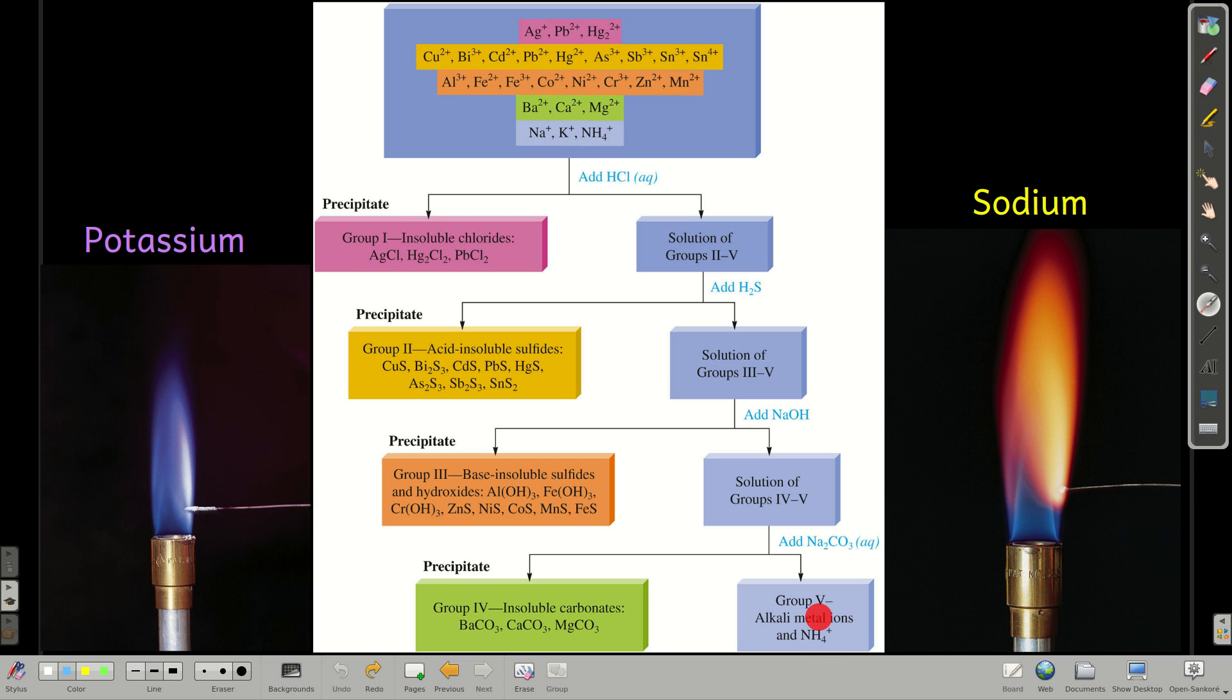Now what we can do here, first of all, there's going to be sodium in here because of the sodium hydroxide and sodium carbonate. But you can test for sodium, probably the best thing to do is test up here for sodium by doing a flame test.